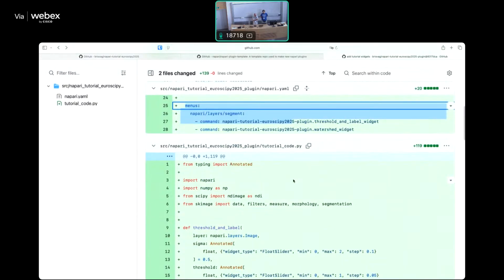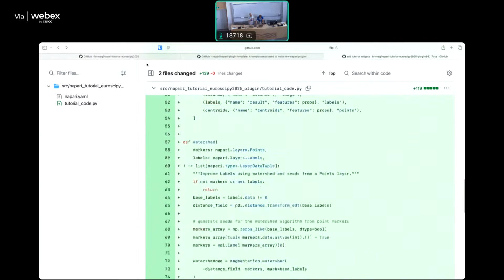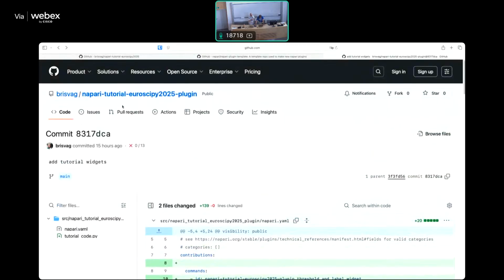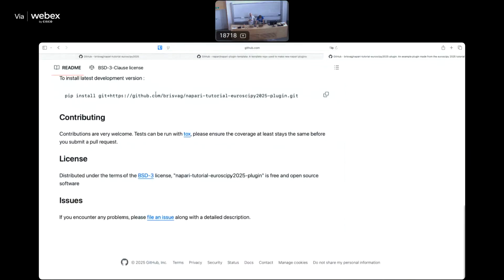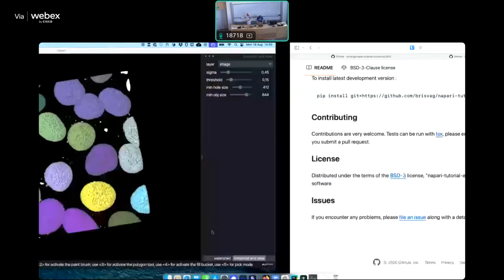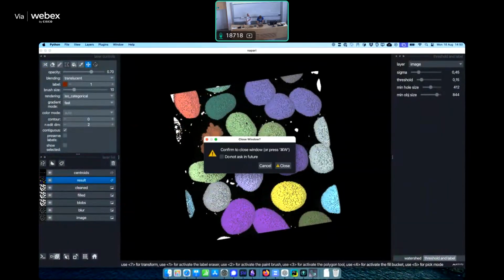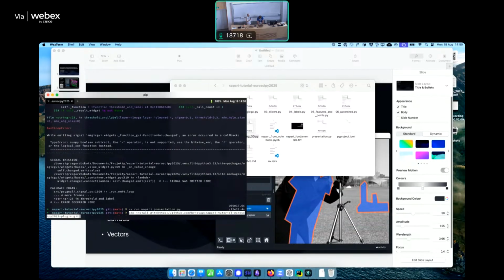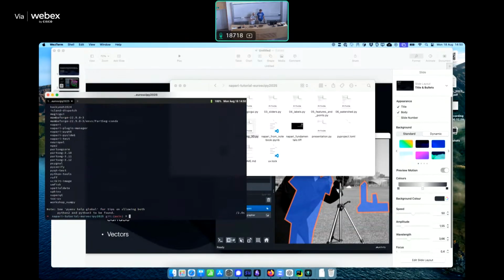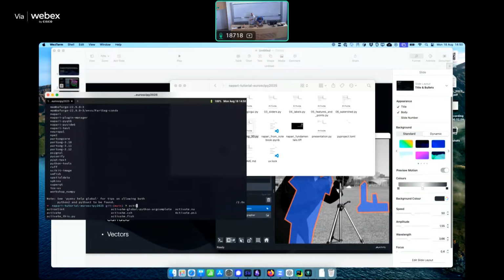If you now run this, you have to install this plugin in the environment where we are. Forgot to do it beforehand. But it should be pretty straightforward. Did you have to UV pip maybe? Activate.